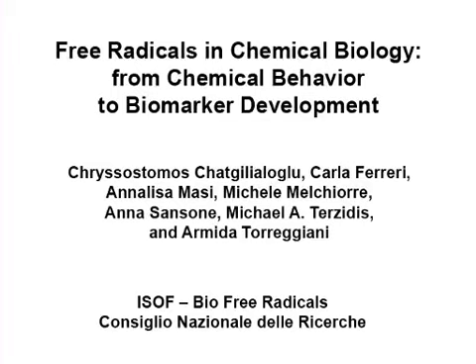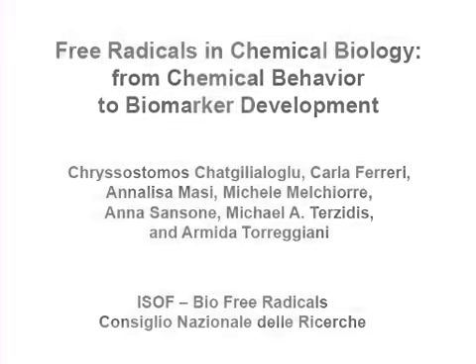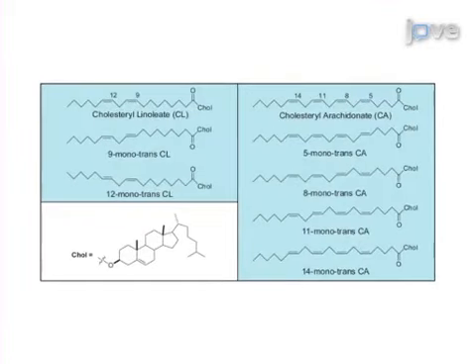The overall goal of this experiment is to provide models of the free radical transformation of biomolecules. The chemical, mechanistic, and analytical information can then be transferred to biology, medicine, and biomarker discovery. This is achieved by first synthesizing appropriately modified biomolecules under free radical conditions initiated by UV light.